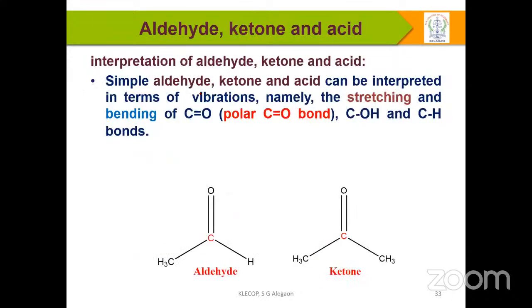Look at this. Next comes another important group you meet day-to-day when working in your chemistry laboratory: aldehydes, ketones, and carboxylic acids. All three contain a polar C double bond O character, which we can call the carbonyl bond. This carbonyl carbon plays an important role.